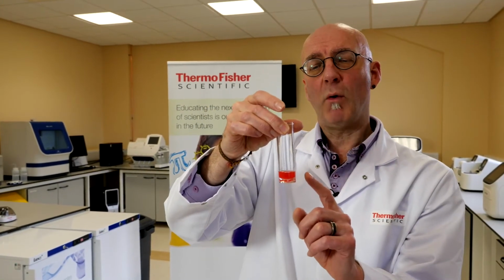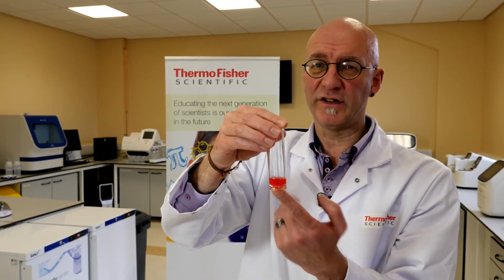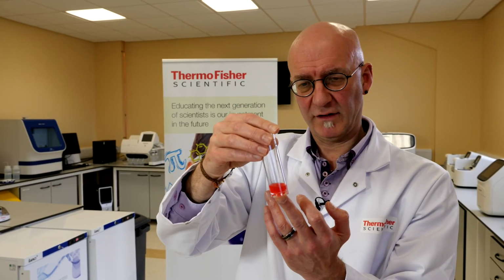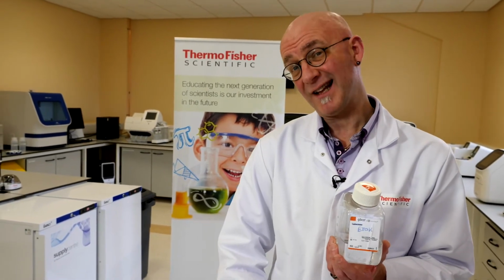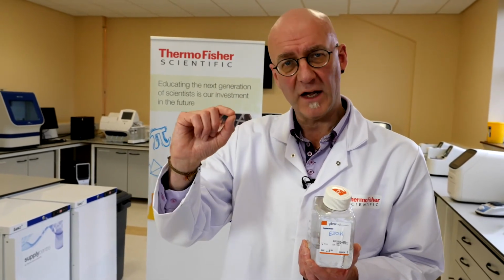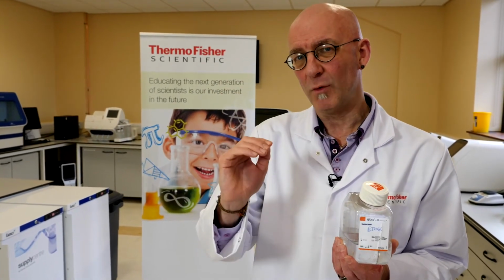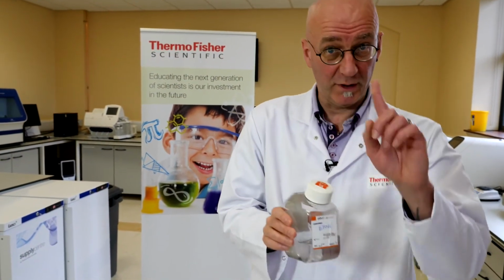So what we need to do now is get the DNA that's in solution to come out of solution. This DNA is going to stay in that solution all day long. Not interested in coming out of solution. It's there, we can't see it, we want to get it out of solution. The way that we do that is we take ice cold ethanol. If I add ethanol and layer it, because it's less dense than water, on top of the strawberry extraction buffer that we have in this tube, where the 2 phases meet, and that's called an interface, that DNA is going to try its level best to get away from the ethanol. And by doing that, it will fold itself up and it will come out of solution. So we're going to do that now.